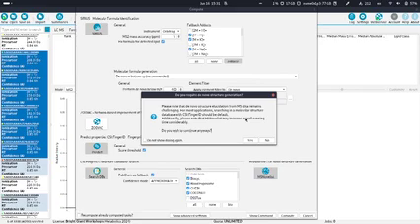And as Fleming said, the project space can get quite large, but it's really the candidate list which makes the project space large. So if you import mzML files, the project space is quite small, often not even as big as the mzML files. But if you then run CSI:FingerID, it gets quite large, just because you search in a structure database with millions of compounds, and they contain metadata, they contain fingerprints, and this stuff is all stored in the project space.